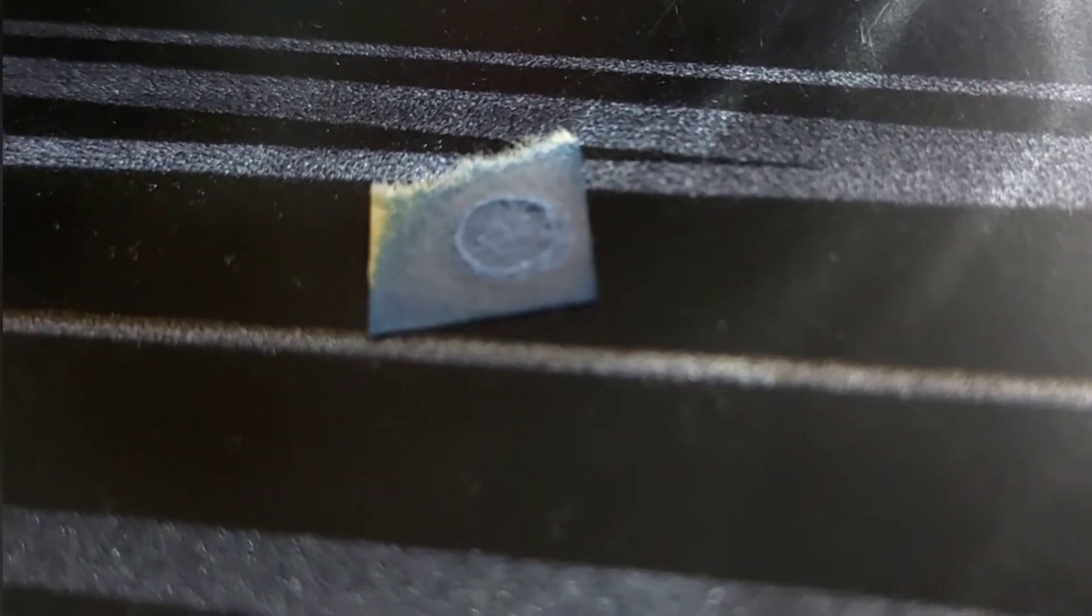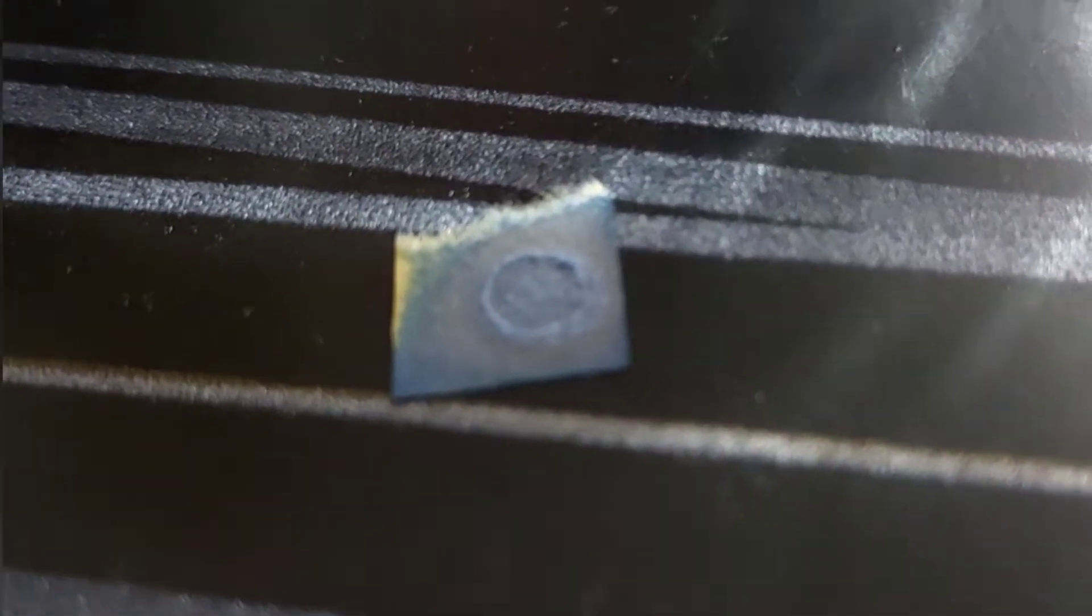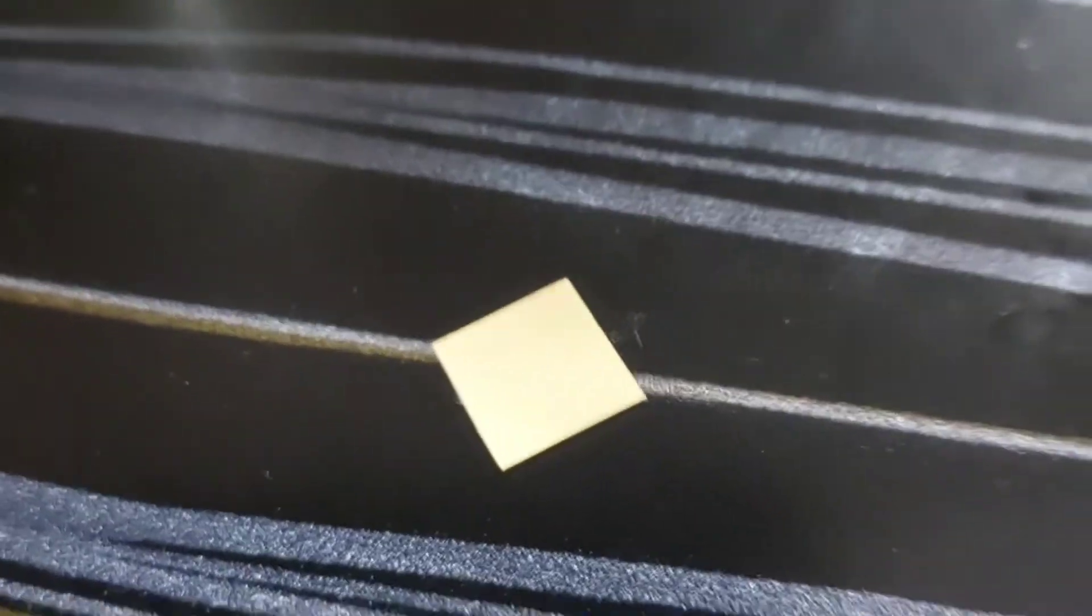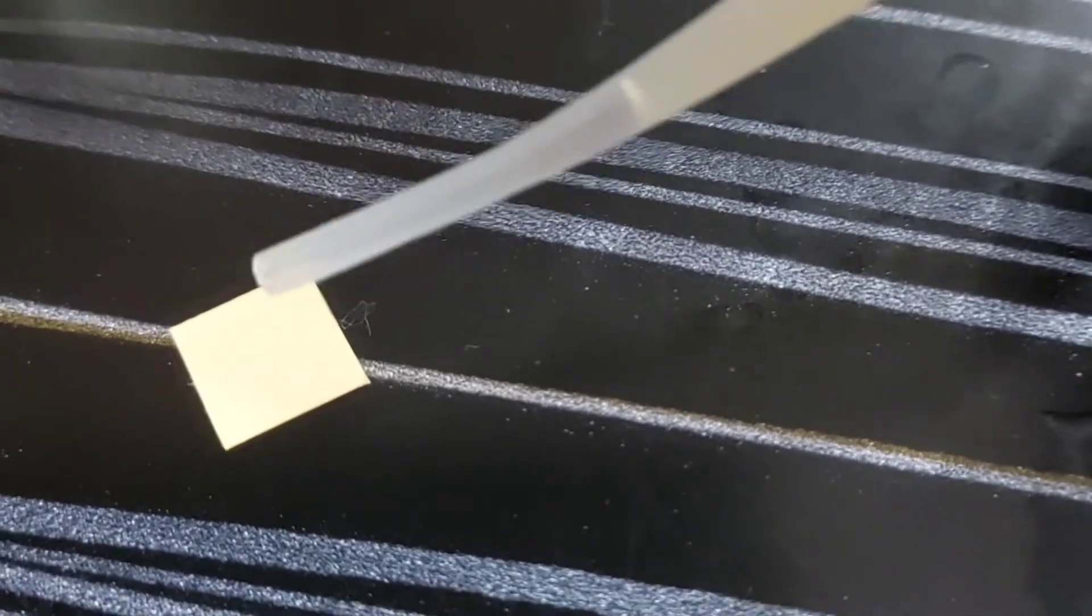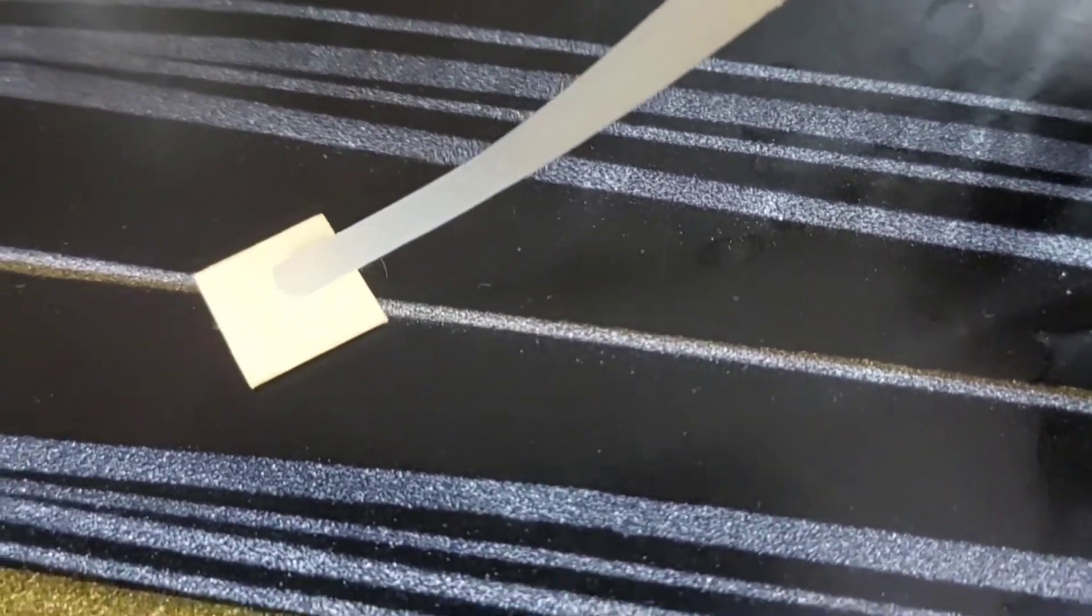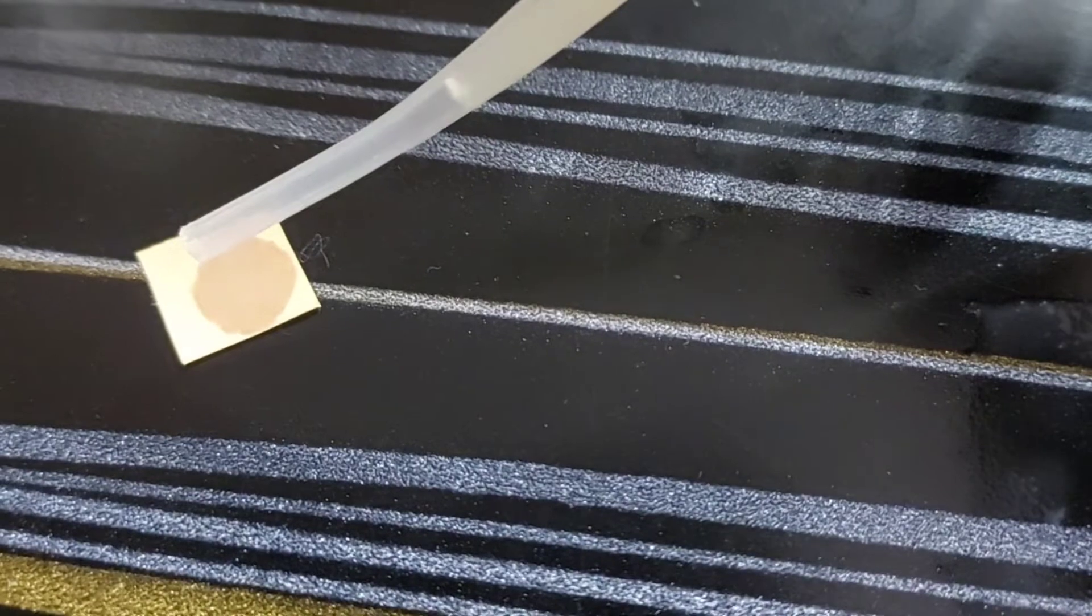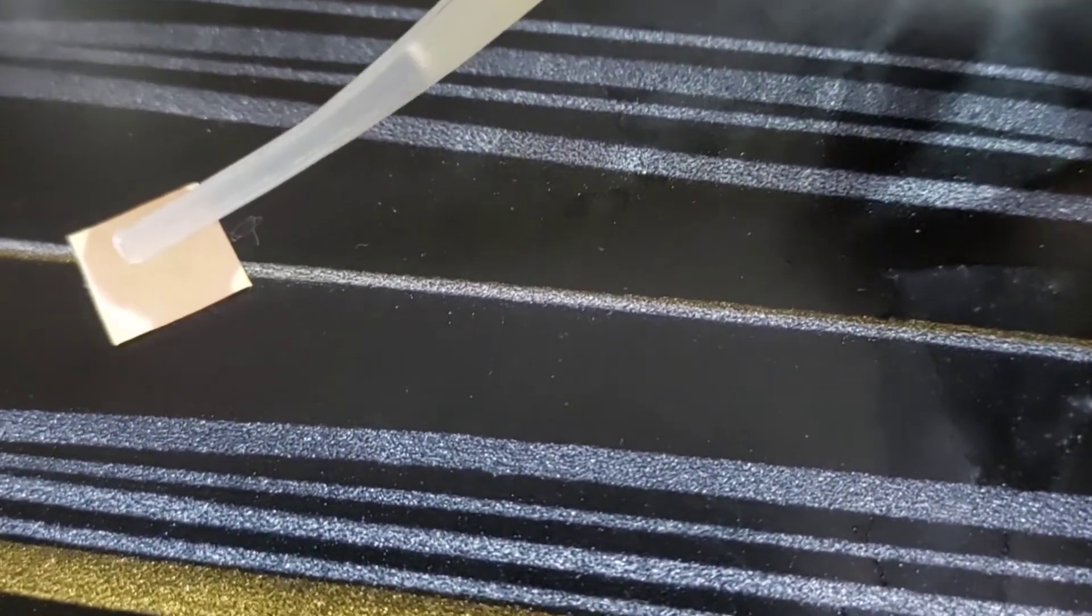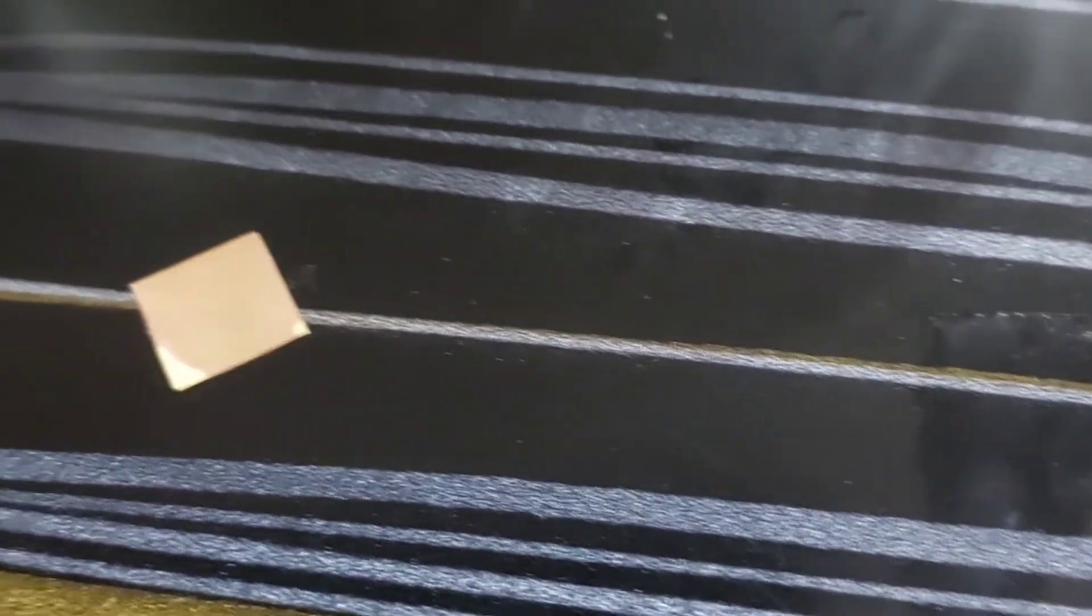Last point for you all: universal indicator is also known as pH paper. Now we have another universal indicator piece and we'll put lemon water on this paper. Here you can see it is converted into light red color, which means it is acidic in nature.